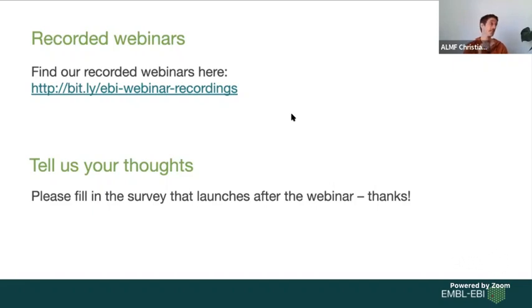Let me give a different answer. Probably the best way would be if you were painting a ground truth image. So you make a manual segmentation first of the results that you want to have, maybe as a label mask image. And then you have a way to automatically compare, for different filter radii, the label mask image you get from your algorithm with your manual ground truth. And then you could almost automatically select the filters.